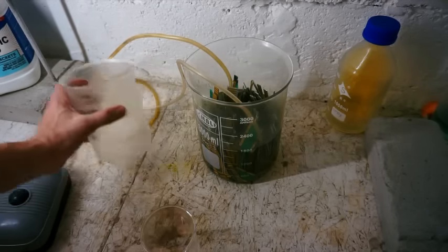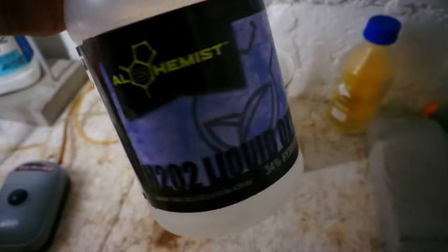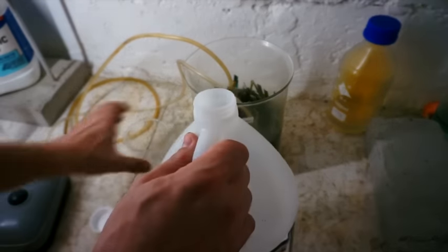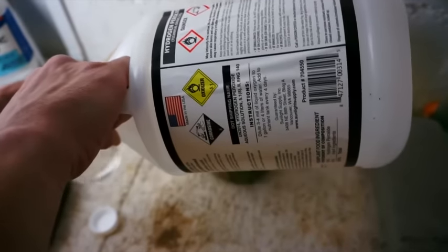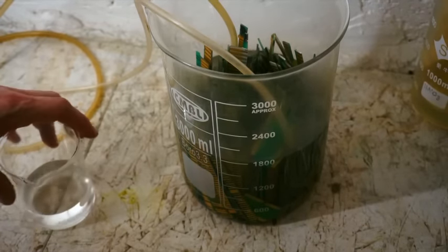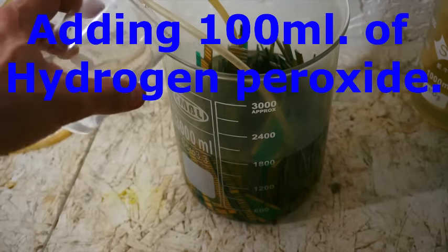Next, we will be adding hydrogen peroxide. I am using 34%. I purchased my peroxide from my local garden and grow store. Remember, when working with high concentrations of hydrogen peroxide, pour slowly and deliberately to avoid any splashbacks.